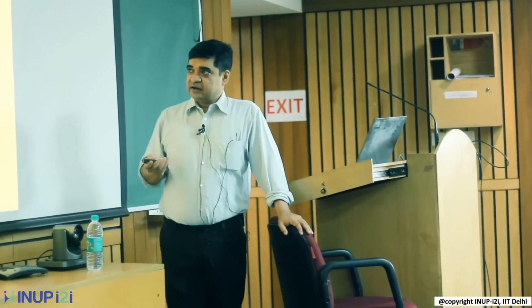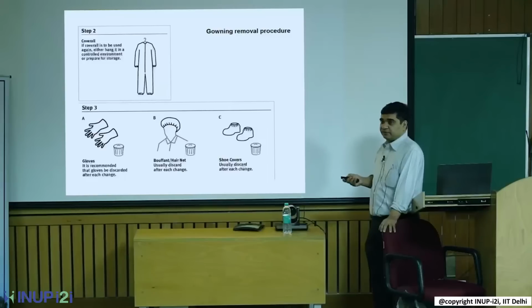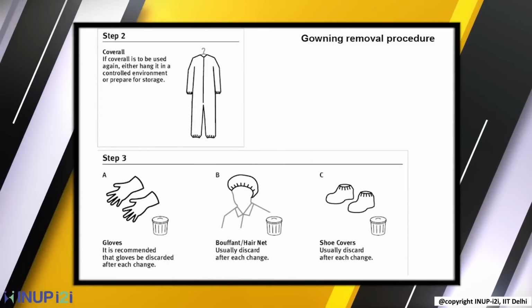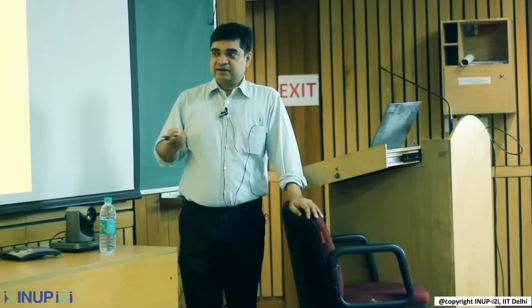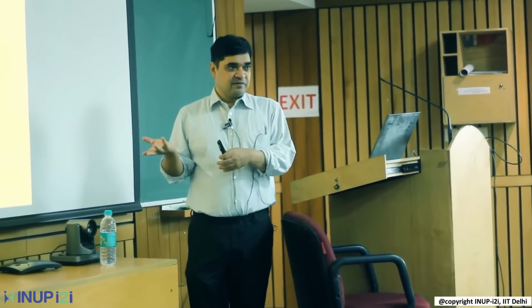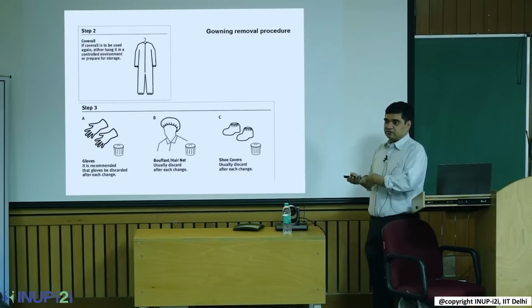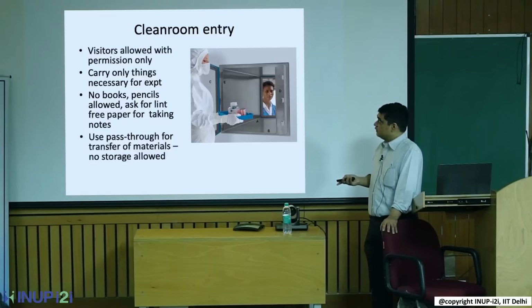You will see that I am wearing 2 pairs of gloves, one here and one here. Why 2 pairs of gloves? So this pair is optional. These are for chemical safety. This is for PP. This is to protect against dust, right. This is to provide chemical safety. When it comes to gloves, the thicker your glove is, the more protection it gives you, but the less dexterity you have. That's why the general purpose gloves are very thin, but if you need any chemical protection, you need thicker gloves. That's why these 2 pairs of gloves are there.